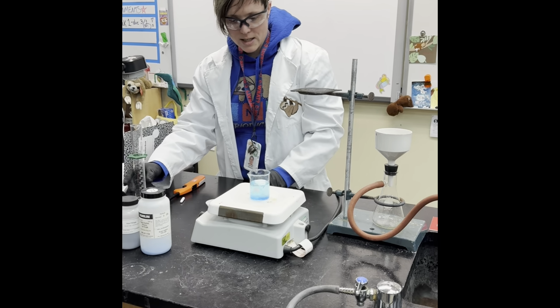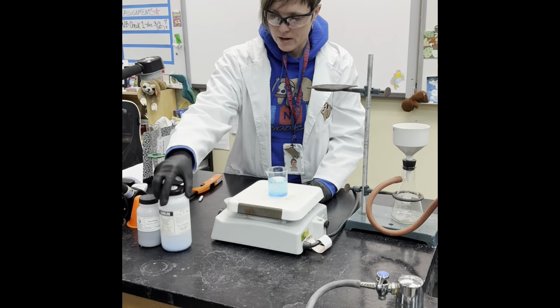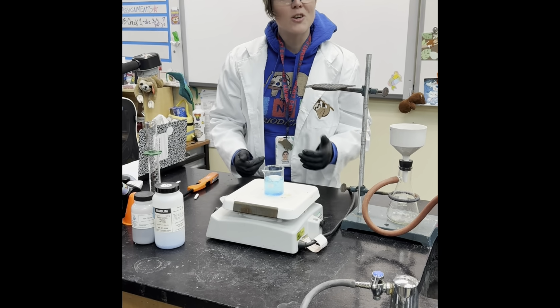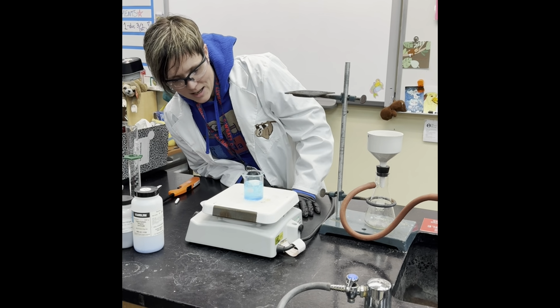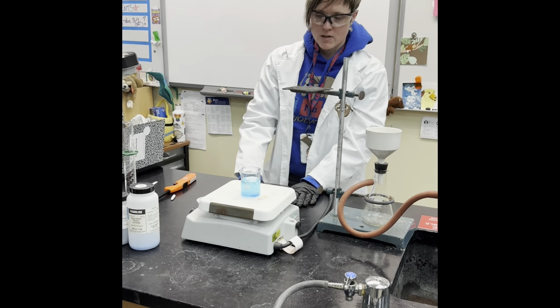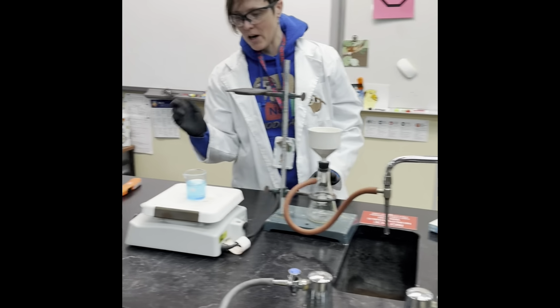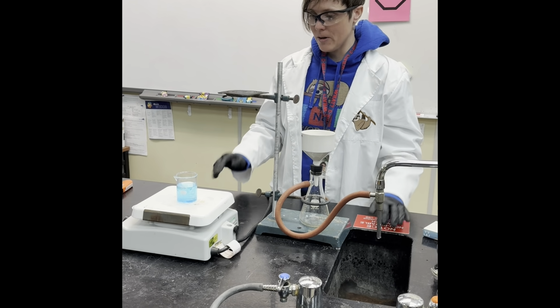Okay, it's a really easy reaction. You add some heat just to, one, dissolve the copper(II) sulfate, but also it increases the rate of the reaction, right? Which we see a lot, adding heat as that little catalyst. So we're going to do that. This whole setup is the after, where we need to isolate our product. So we're going to make some solid copper, right?